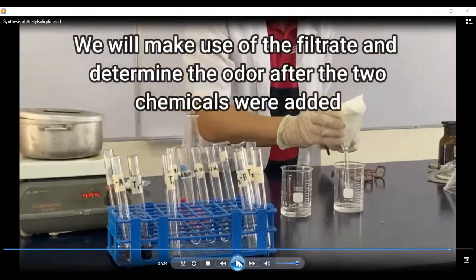So it's similar to one of the chemical tests in experiment number 3. It's an example of an esterification reaction. The positive result here is based on the odor of the product. Jerby was again the one who smelled it, a third party to avoid bias.